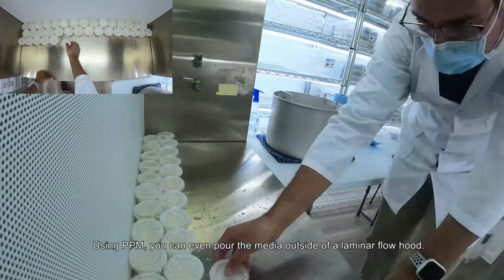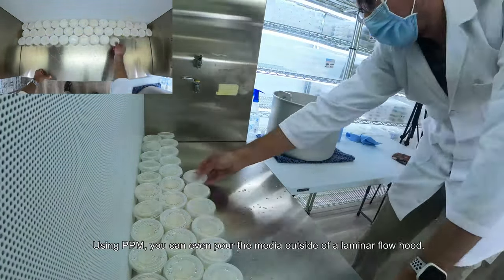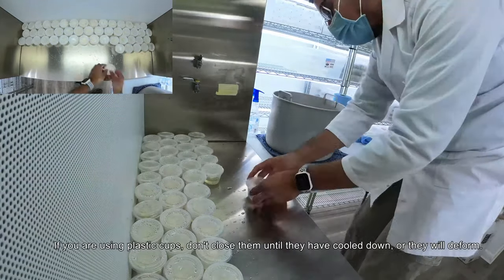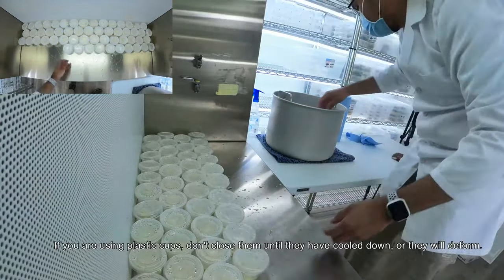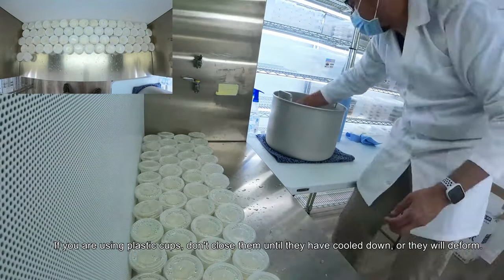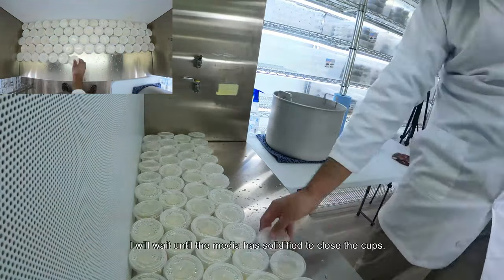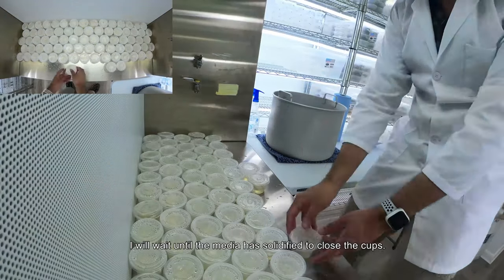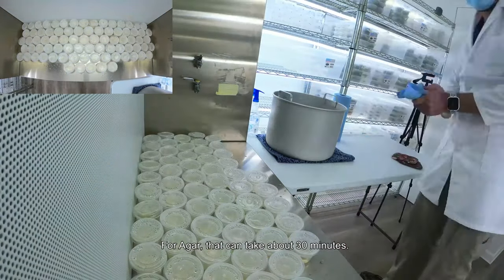Using PPM, you can even pour the media outside of a laminar flow hood. If you are using plastic cups, don't close them until they have cooled down or they will deform. I will wait until the media has solidified to close the cups — for agar that can take about 30 minutes.